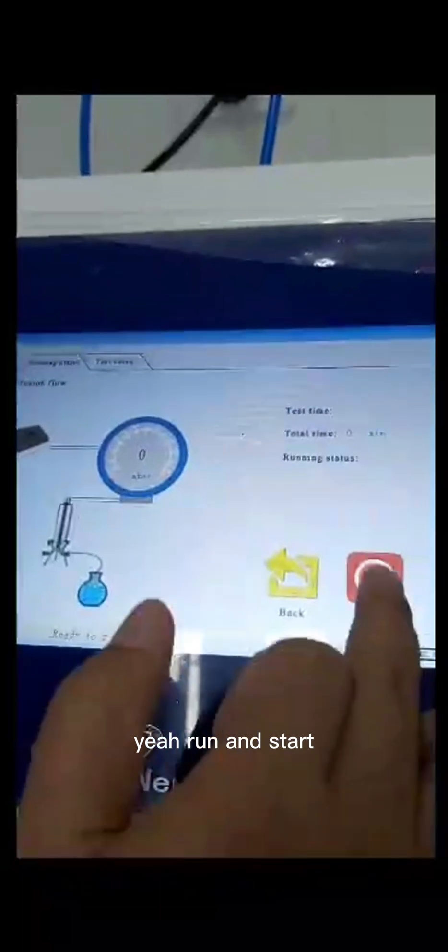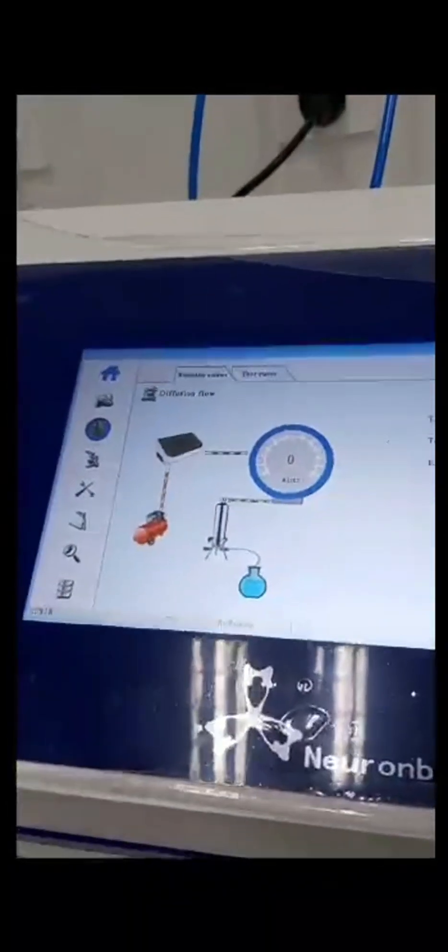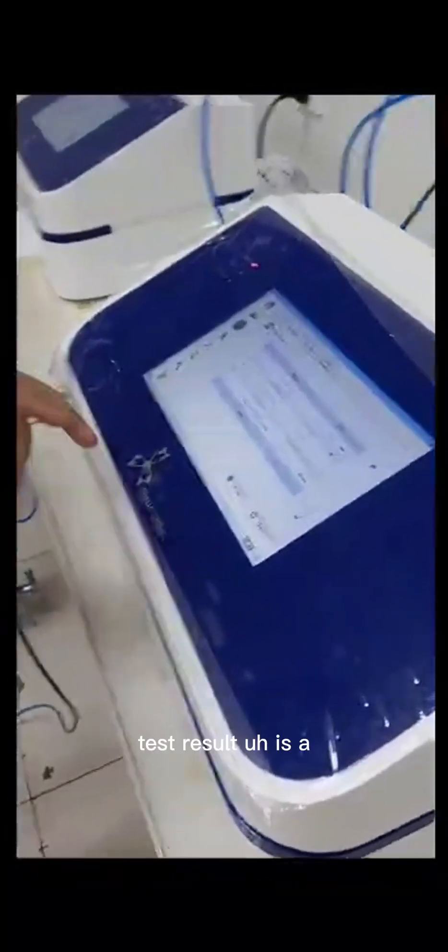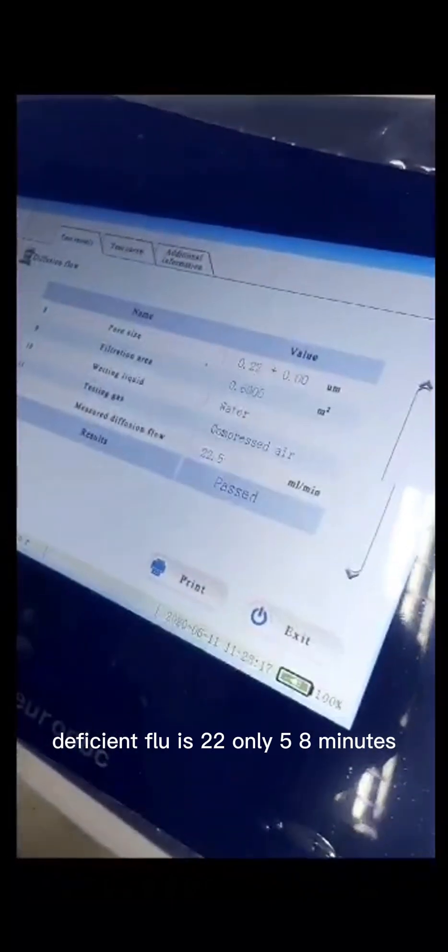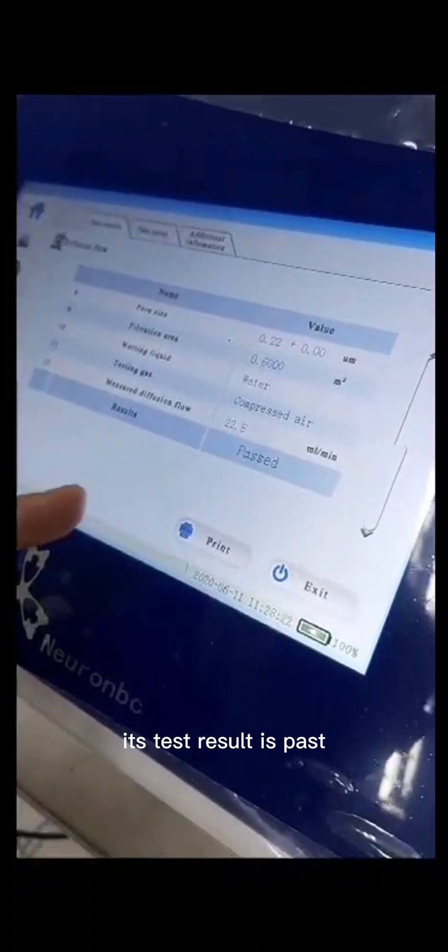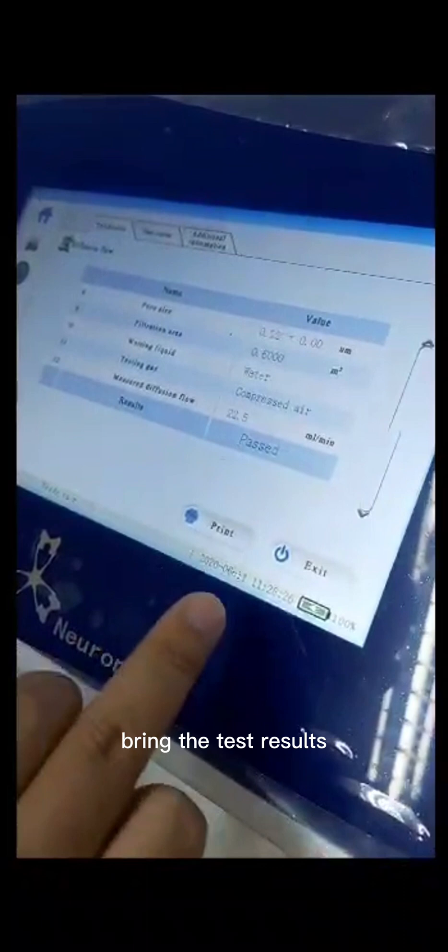Run and start. We already finished the test. Test result is a diffusion fluid is 22.5 ml per minute. It's a test result is passed. Now we print out. Print the test result.